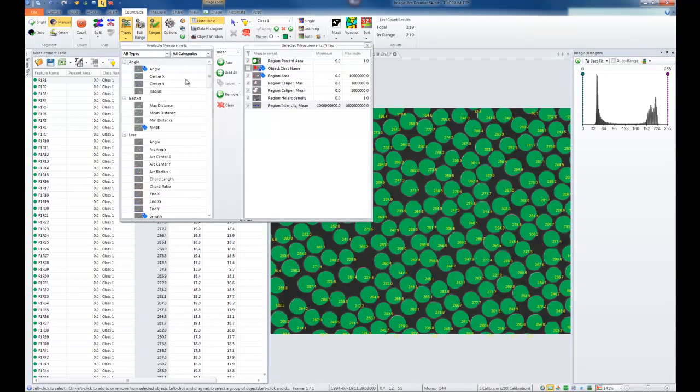By going to the Types menu, I see that I have all of the values on the left-hand side. This is all of my types, and this may be more types than I actually need. For this reason, there's a drop-down available where I can filter down on only the types of measurements I will be making. In this particular case, I won't be drawing lines or best fits, but only looking at regions. So I'll select region. I'm given both my object and region measurement groups.